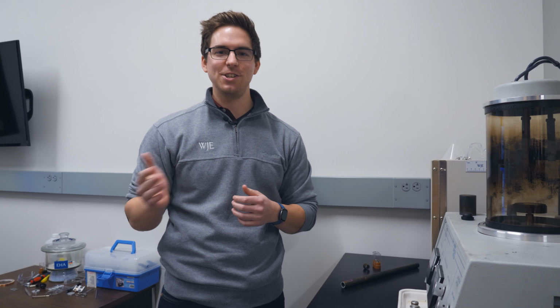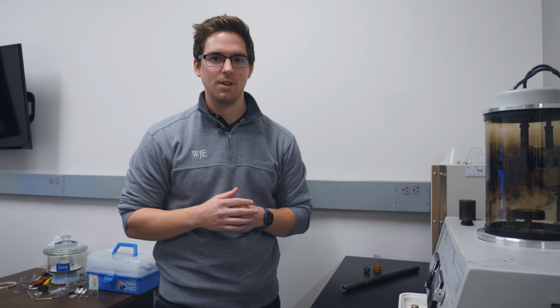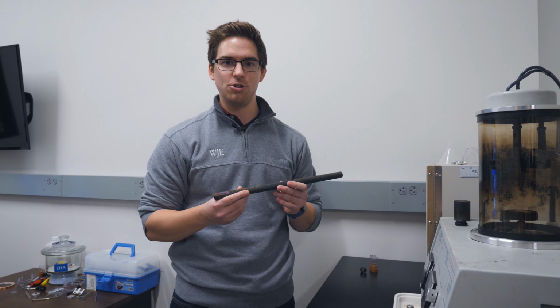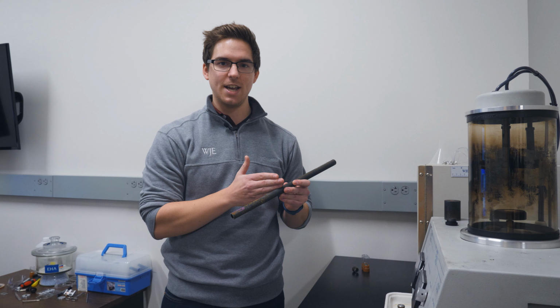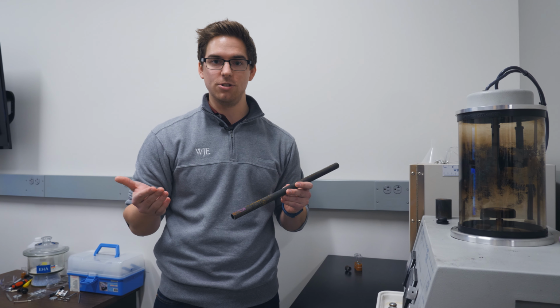Thanks, Hugh. As you just saw with the petrographic sample, I'm going to show you how I use this for metallurgical samples. A common type of sample we get a lot is tubing and piping. In this case, this is a heater tube from a refinery, and as you can see, there's some corrosion and pitting on the outer surface.